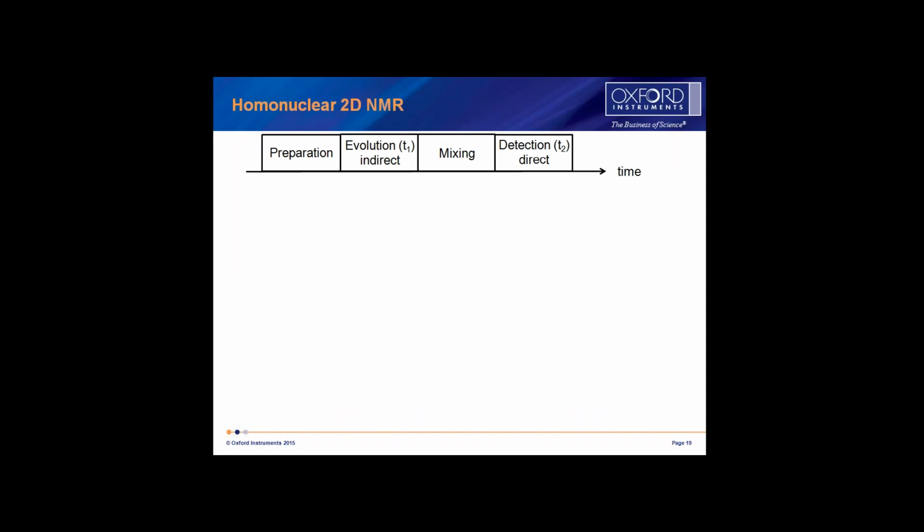In the cases where we maybe have 1 or 2 samples and we're looking to confirm a structure or the presence of a certain chemical, we can use more traditional NMR experiments. And in this case, we'll talk about some of the homonuclear 2D NMR.